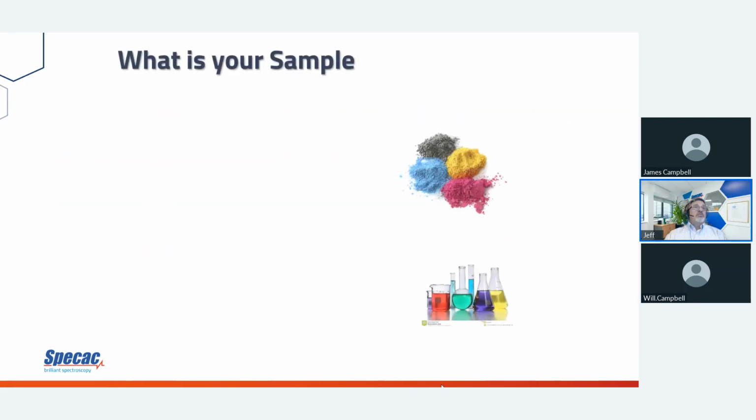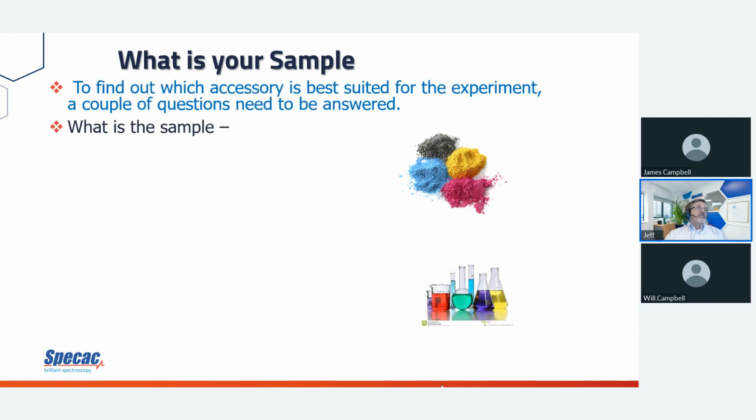So the first question I ask is, what is your sample? Plain and simple. What is it? Solid, liquid, a gas? We can analyze all of them. It all depends on what you need from that sample.